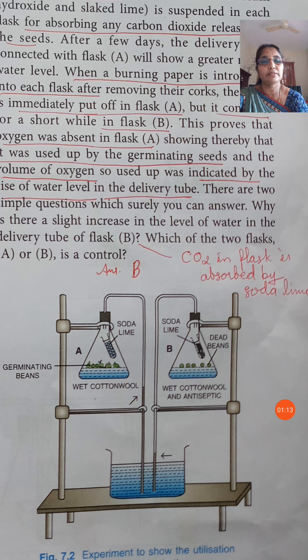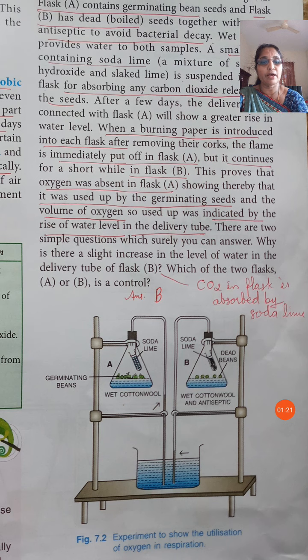Both the flasks are tightly closed with a cork and connected with a delivery tube from each flask. The end of the delivery tube is submerged in a beaker containing colored water.